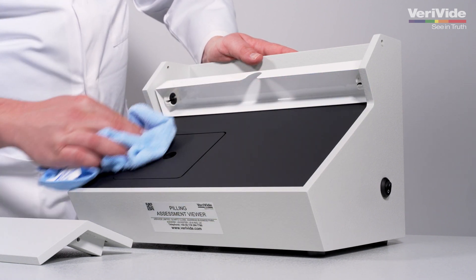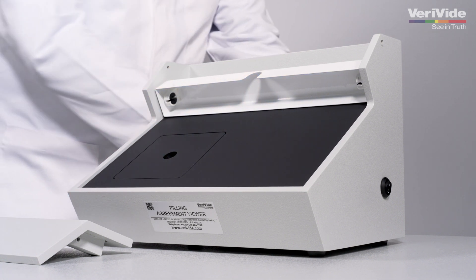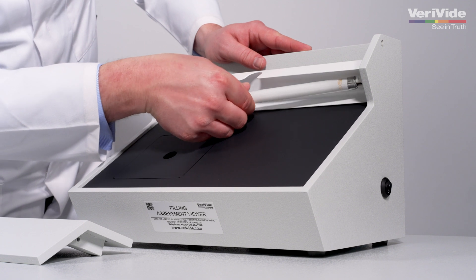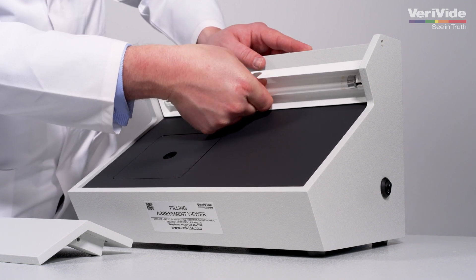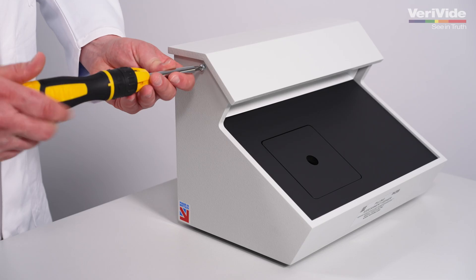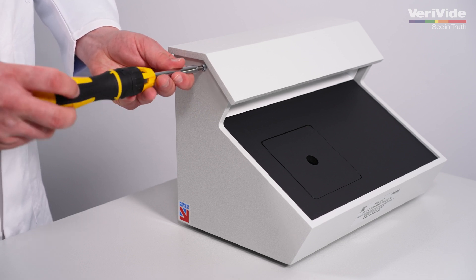Verivide offers two versions of the PAV — a 230V or a 110V. Please specify which you would like at the time of ordering to ensure you receive the correct voltage for your PAV unit. The standard lamp type is a Verivide CIE artificial daylight, with an option for a CWF cool white if required.